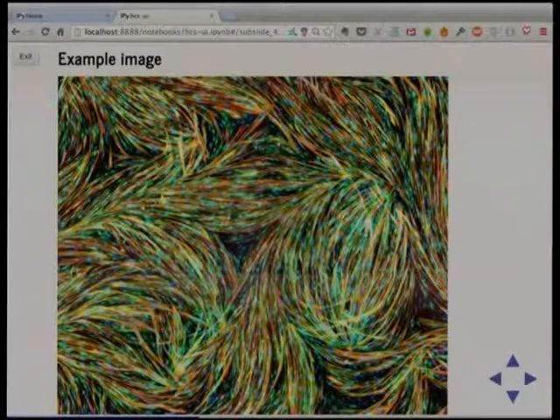So this is from the screen that I've been mostly working on. It's from Christophe Marcel at Monash. And the main thing that I want you to take away from this image is that there is no way you're going to count cells or find the cells in here. These are muscle precursor cells, and what they do is they start fusing together when you put certain factors into the thing in order to form muscle fibers.